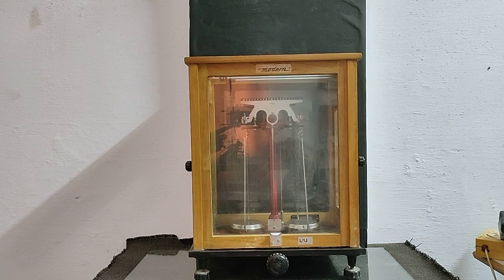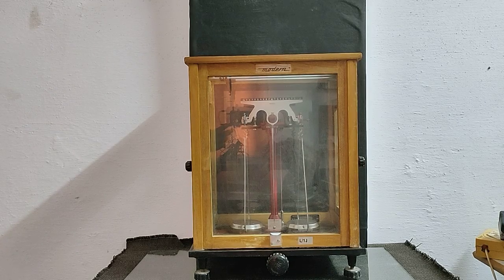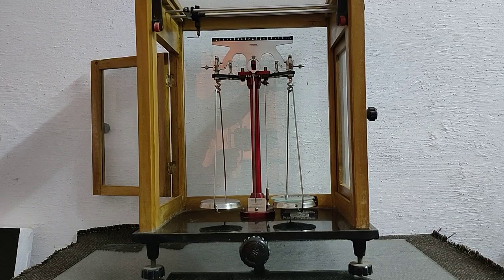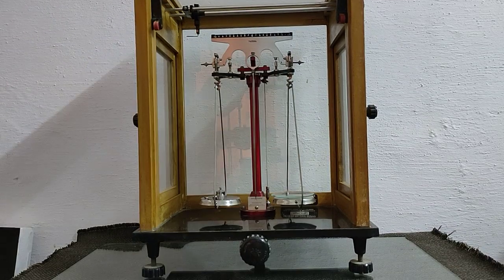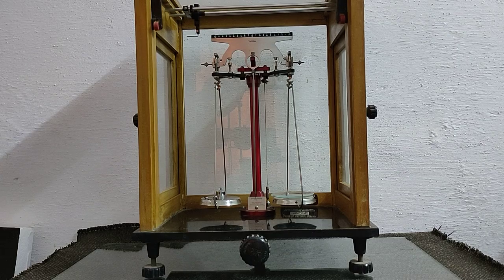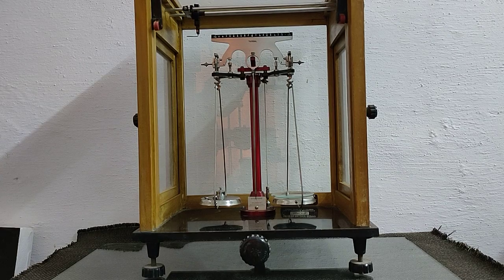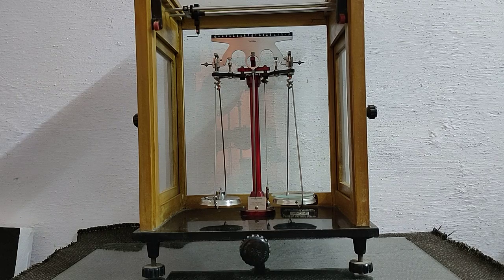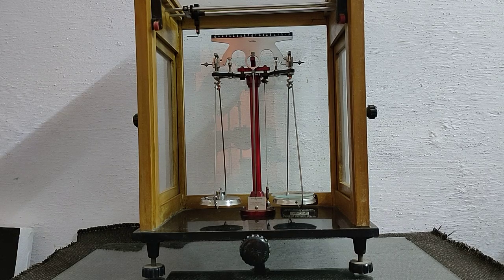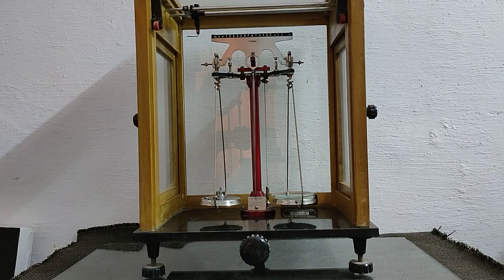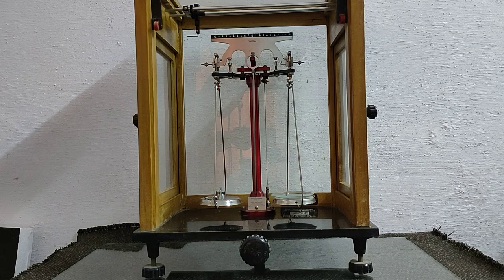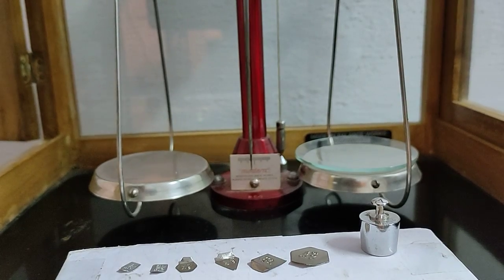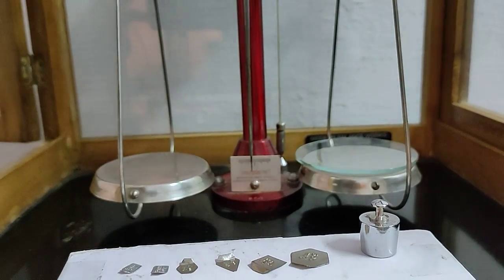Chemical balance has four adjusting screws, enclosed in a wooden box having two doors. Keeping watch glass on right hand side, keeping weights at left hand side. Pointer comes at zero means it is exactly balanced, and our weight is 20.890 gram weight of watch glass.